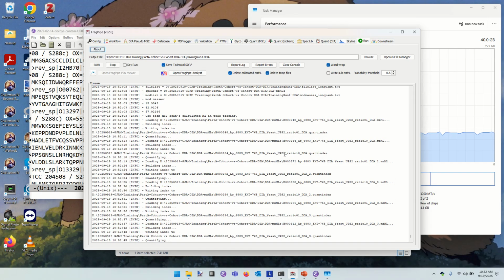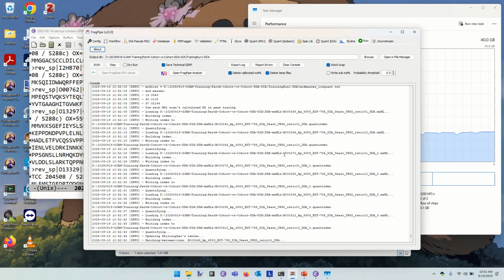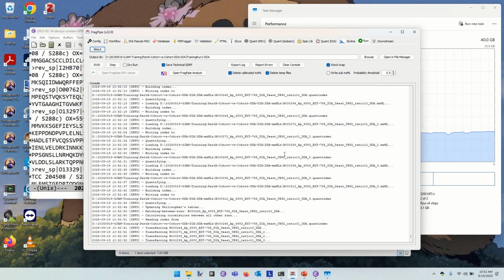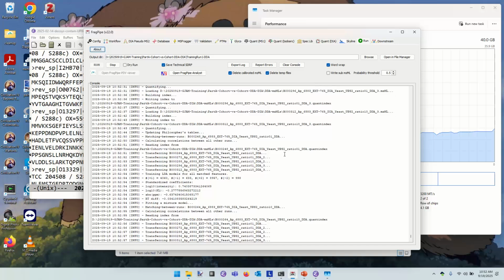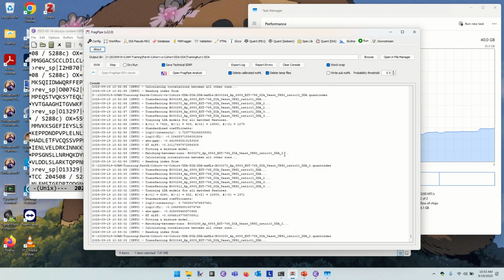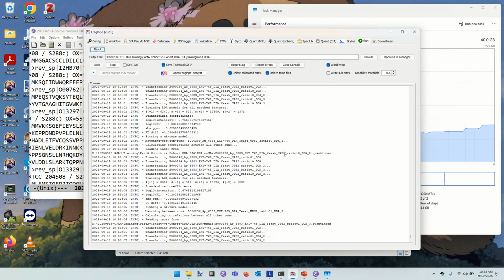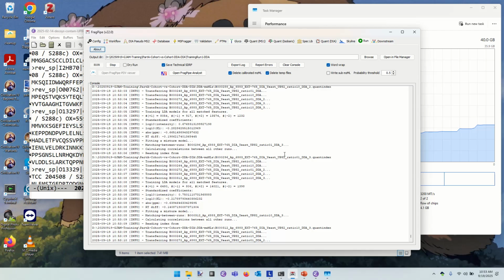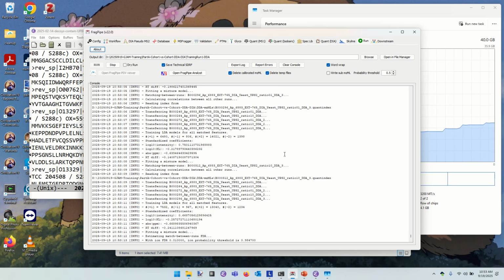All right, finally it's gotten to a quantifying step. So we finally moved into the IonQuant stage. IonQuant is looking at the first appearance of a peptide ion in an MS1 scan, rising to a crest as you get a couple seconds into its moment of arrival, and then it will very slowly fade, tail off at the end. It needs to quantify that curve of intensity values seen for the peptide, and it writes that down for each raw file separately.